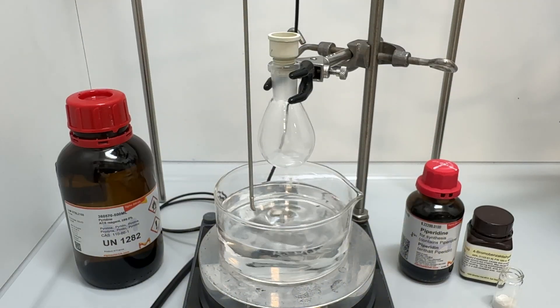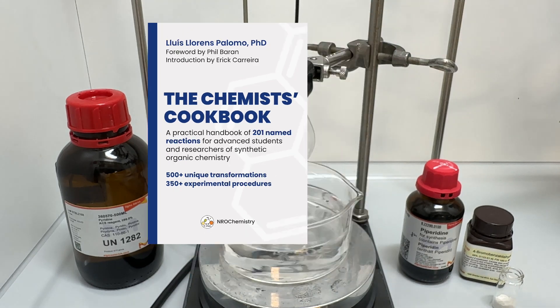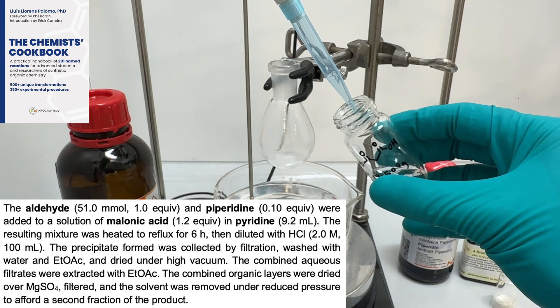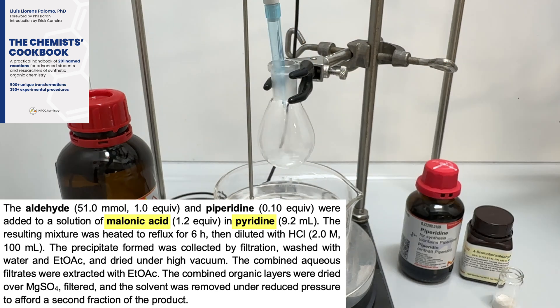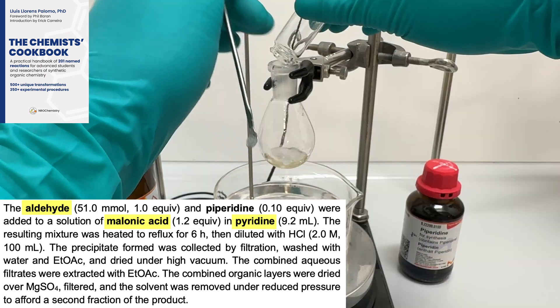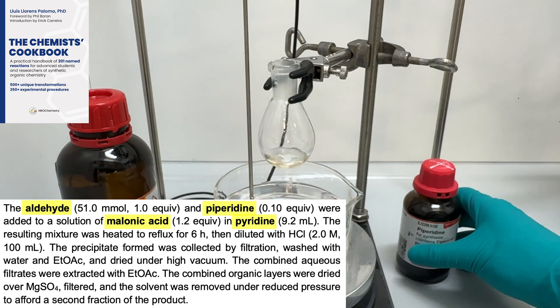To set up the reaction, I followed a procedure outlined in the Chemist's Cookbook. According to this procedure, in a round-bottom flask equipped with a magnetic stir bar and charged with 1 mL of pyridine, I added about 1.2 equivalents of malonic acid dissolving in DMF. To the solution, I added 1 g of bromobenzaldehyde portion-wise, followed by catalytic amounts of piperidine — about 50 µL.